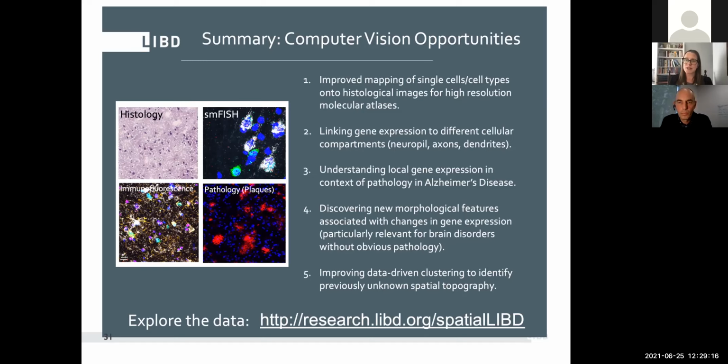So they're making their spots even smaller. And there, it's the opposite challenge. So now with some of the new HD platforms that are coming out, you will likely have multiple spots per cell. So you will have the opposite problem where you need to put your spots together to kind of build one cell. But I think the higher resolution for some of the unsupervised approaches is probably better, because you may be able to associate some of these very small spots that might only be 5 microns with different features of a neuron, like perhaps a process or a cell body. So both sides, high resolution and low resolution, have their own problems, I guess.